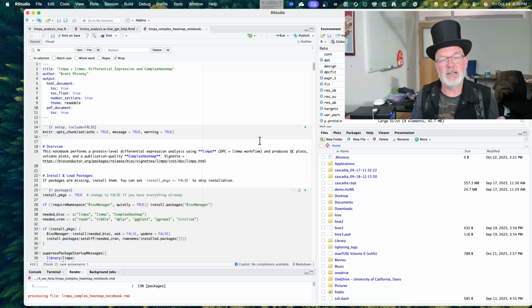I wanted to do a more recent version of DIA-NN. It hasn't really changed much from my video 2 years ago. There's some under the hood stuff that's changed I can get into, but running it's pretty similar. So anyway, I'm going to try to do that next.